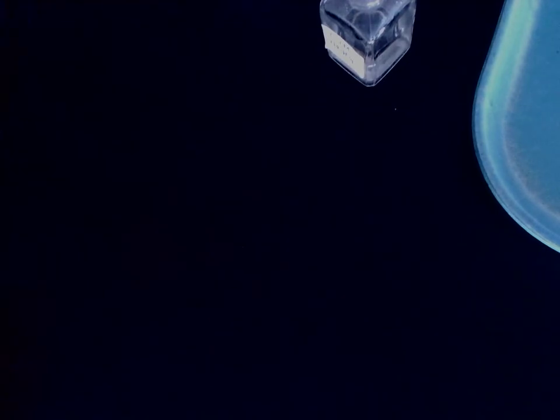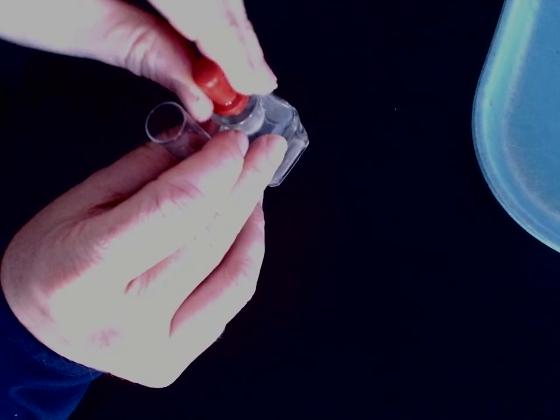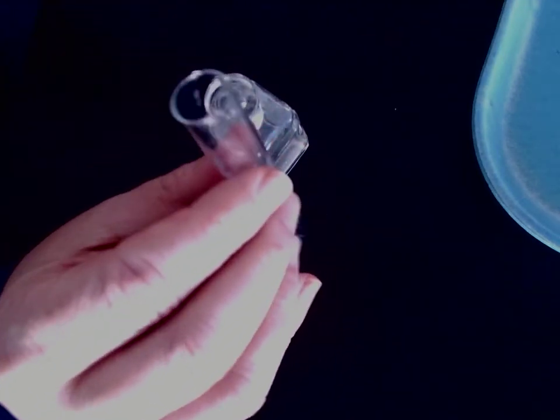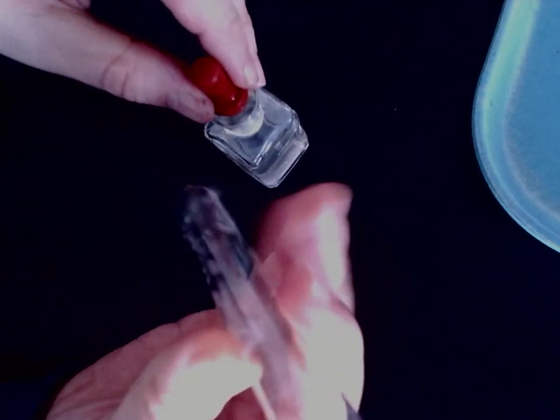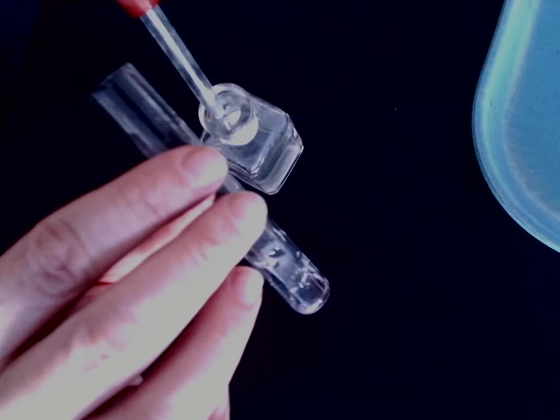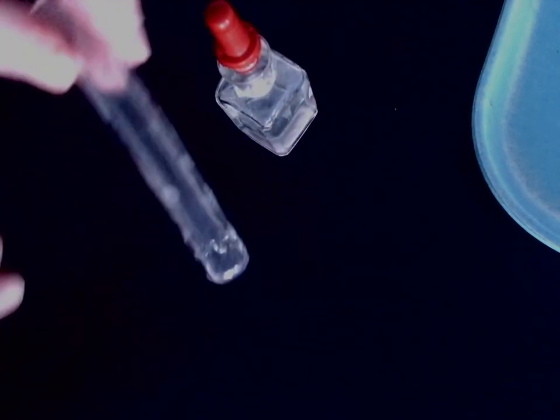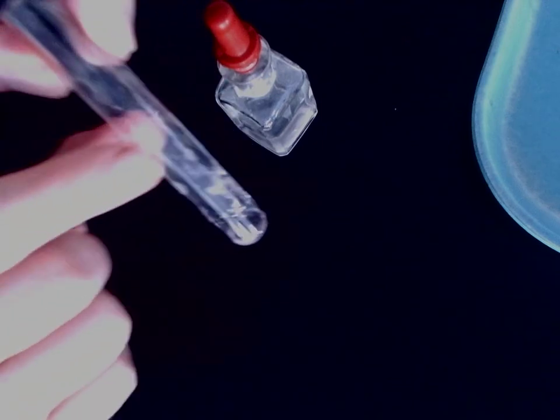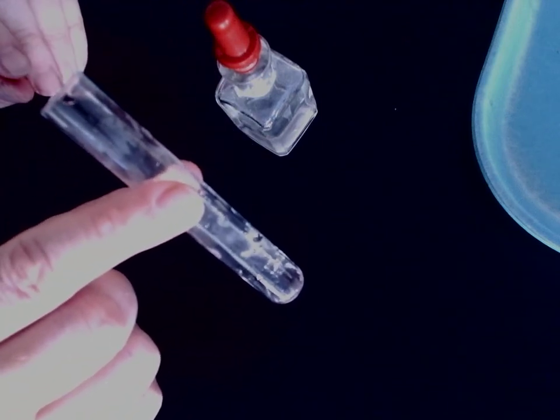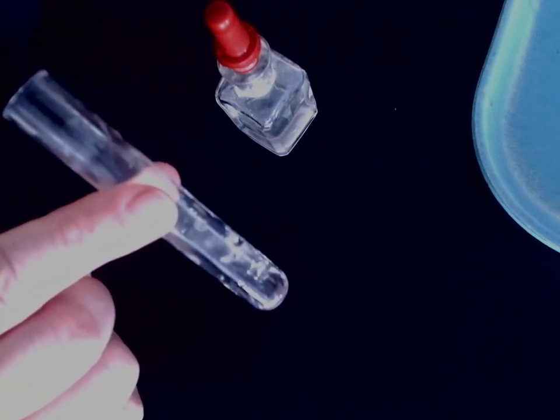Next up is sodium phosphate plus magnesium nitrate. This one's foggy — I thought that was a dirty test tube. There's the sodium phosphate, and now we've got the magnesium nitrate.